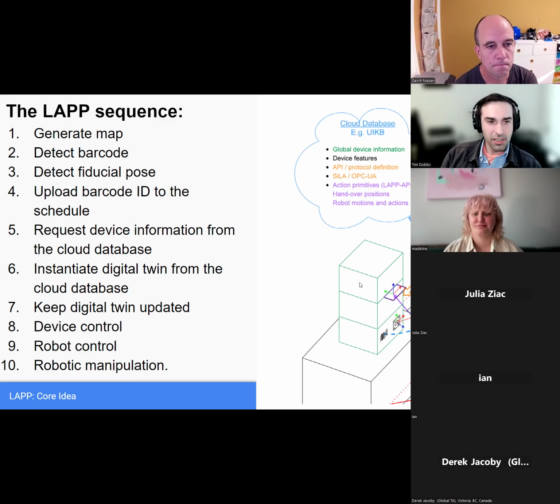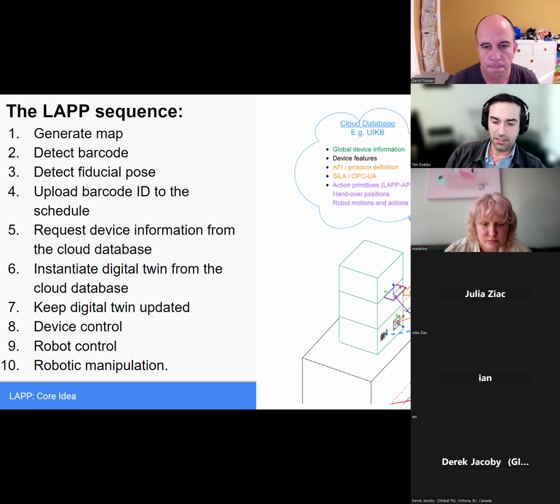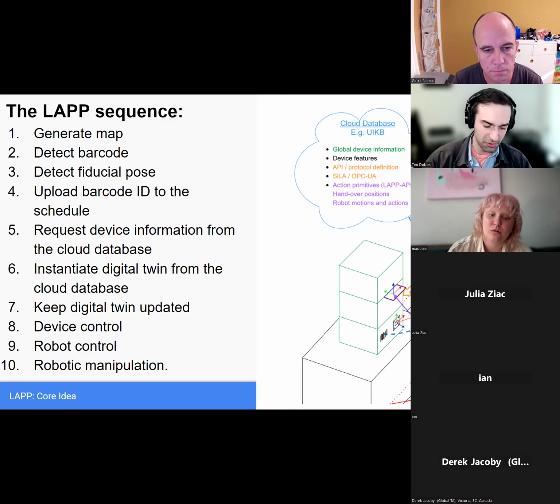So at this point, it says, cool, I have scanned the thing I'm using, and then it imagines we're going to go talk to, in yellowish here, something they call a scheduler. This is something that's managing the current state of everything. They give an example of this software called UniteFlow. I don't know if this is an Austrian thing or not, but basically, these are scheduling tools.